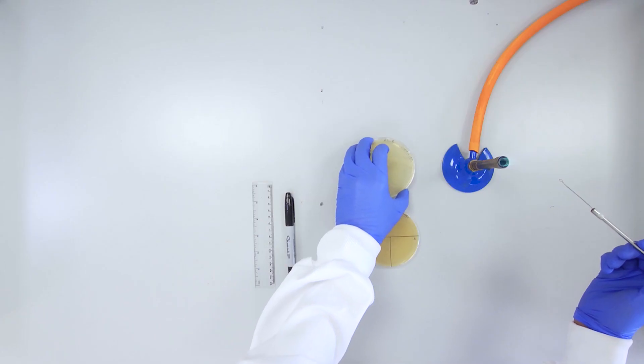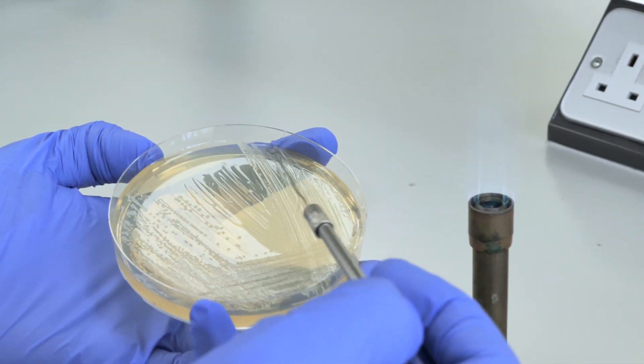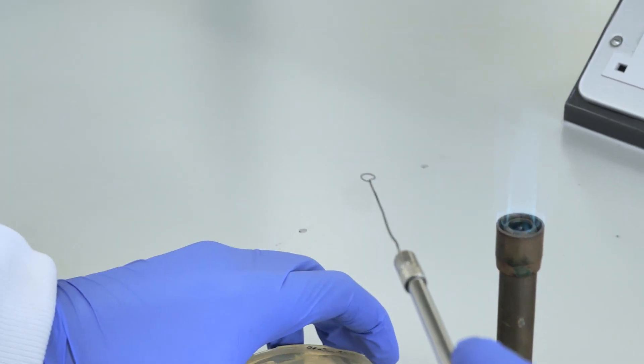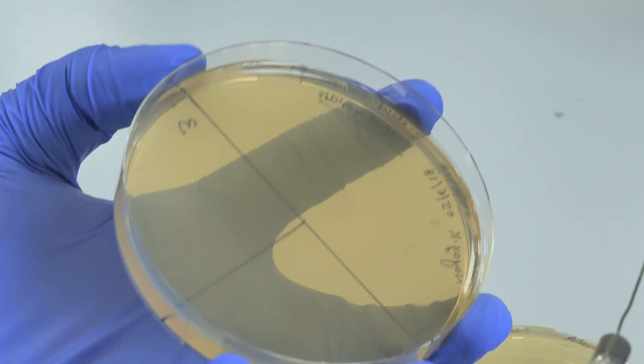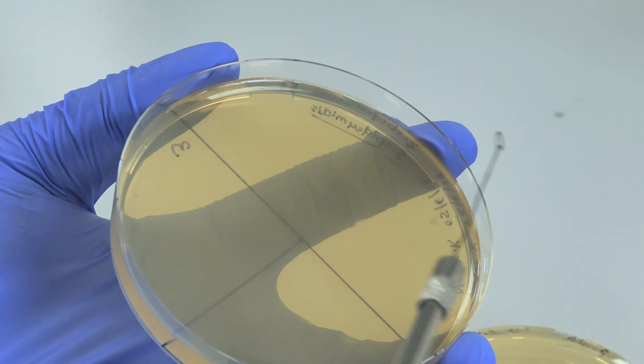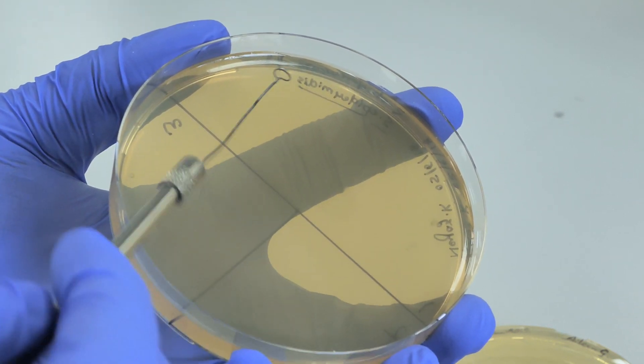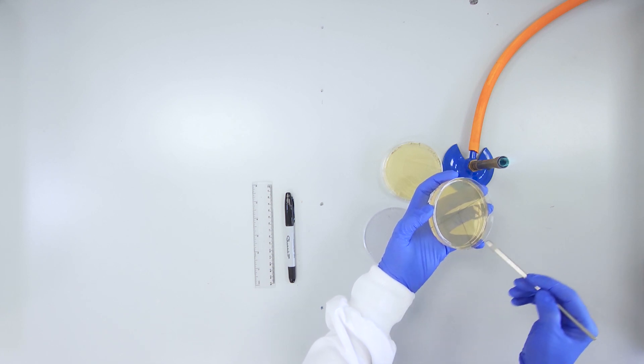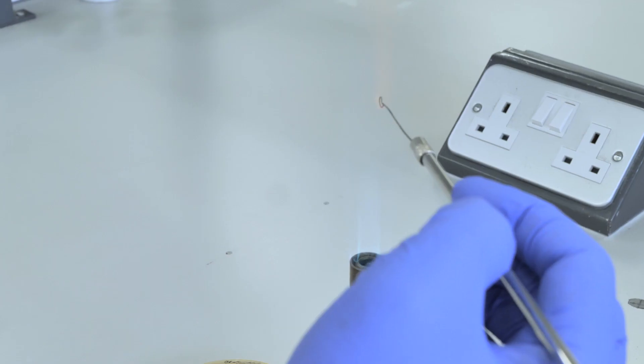Next, remove a single isolated colony from the pre-prepared E. coli plate using your now sterile loop. Streak this colony onto section 1 of your sterile TSA plate using a single continuous zigzag line. Note that the opened plate is held close to the flame and the lid is left in the updraft of the Bunsen burner.